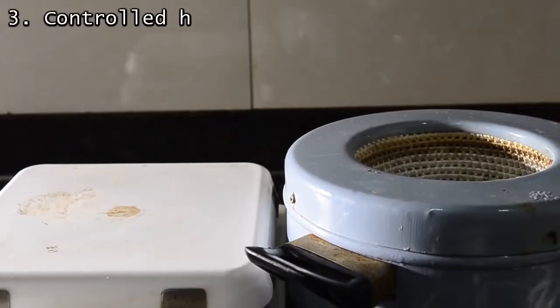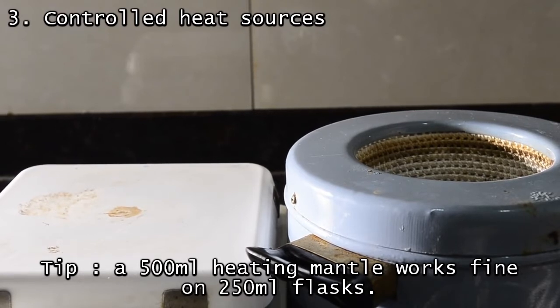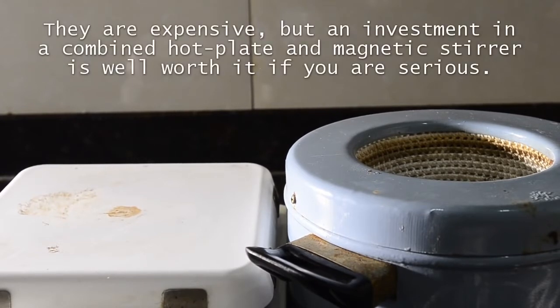Next is heating. We strongly recommend you don't use naked flames for heating. We have two heat sources: on the left, our hot plate stirrer, and on the right, the heating mantle, which fits the 500 ml flask but works just as well for 250 ml flasks. If you're serious, we recommend making the investment and getting a proper hot plate.